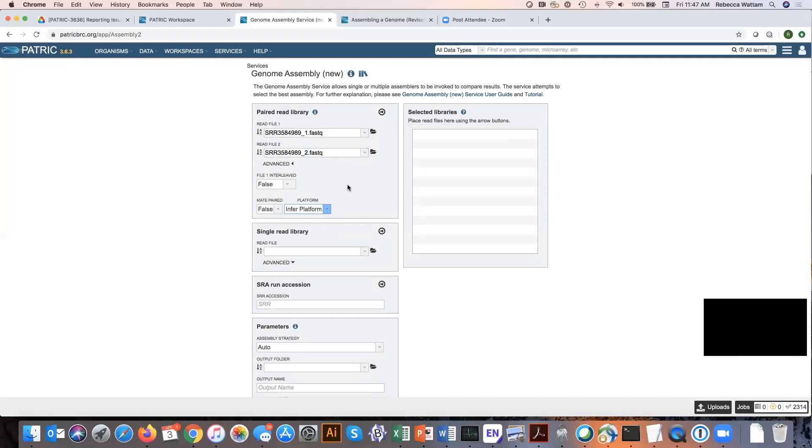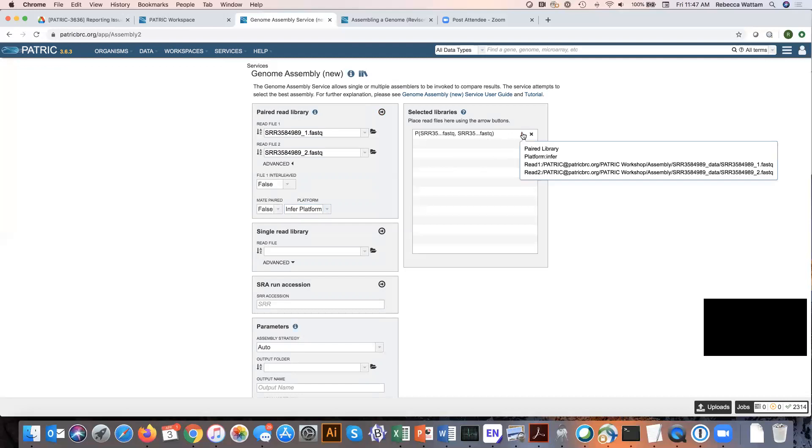So this is the information I want tagged to my reads, and I need to move these reads into my selected library box. To do that, I click on this little arrow in the upper right corner of the paired read library box, and it moves it there. I can look by mousing over the information icon that it says there's a paired library, it's instructing Patrick to infer the platform, and it's showing the two different reads and where they came from.